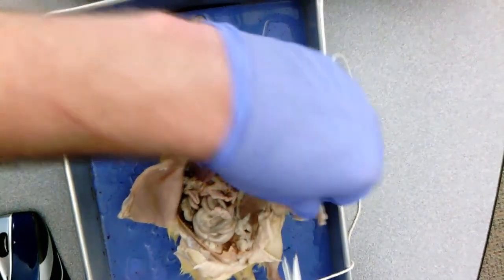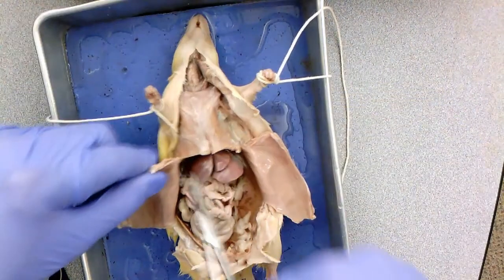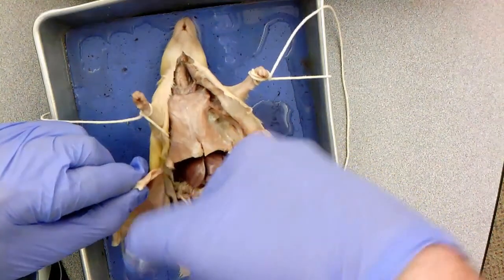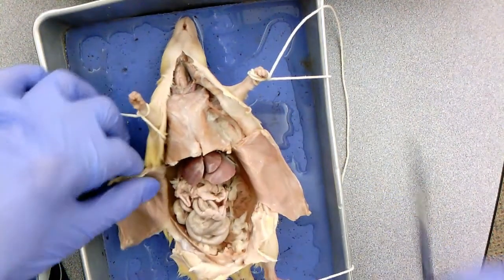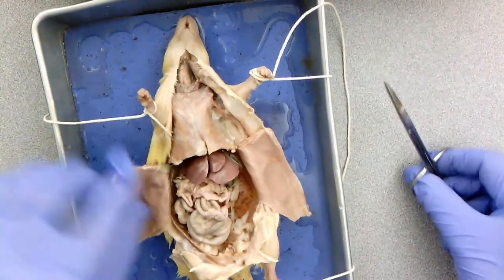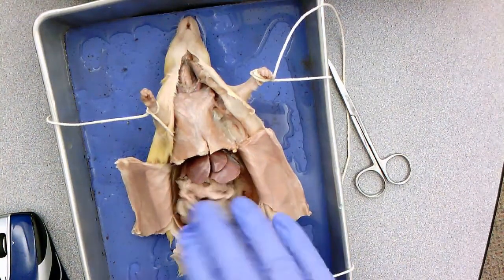But you're going to open this cavity up right here. This is the abdominal pelvic cavity that we have here. This is the one cavity in your body that's not protected by bone. So this doesn't have a lot of bone protection associated with it. A lot of times when you get injured in this region, like when you wear a seatbelt or something, this is a region that gets injured because it's not protected by bone whatsoever.